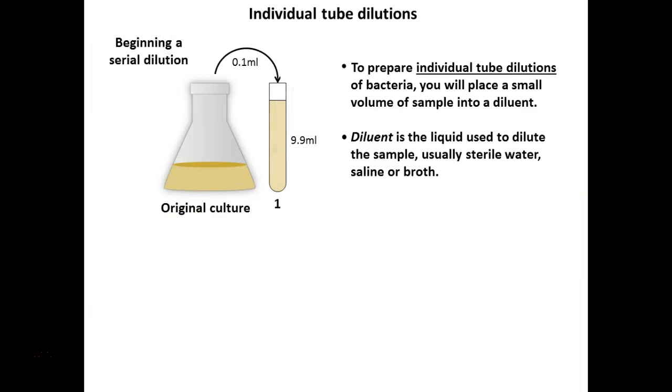The units don't matter as long as they're the same, but for this we always adjust it to milliliters because we always record the concentrations in milliliters. Even if we do our dilutions in microliters, you can convert between the two. The difference is a 1,000-fold difference. 1 milliliter equals 1,000 microliters.